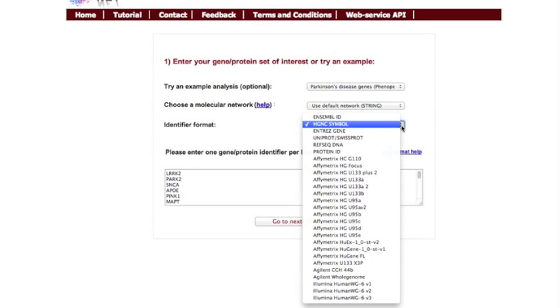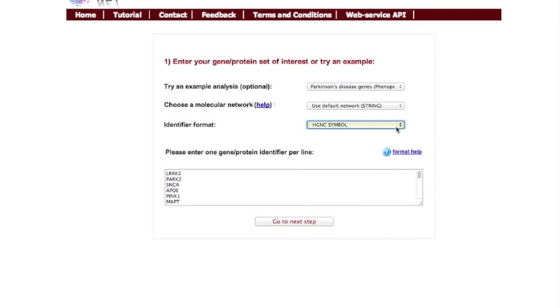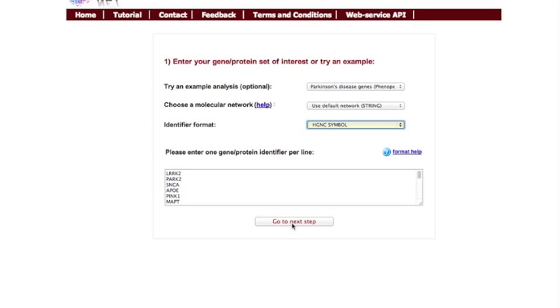You only need to make sure that you choose the appropriate identifier format for your data. Then click next.